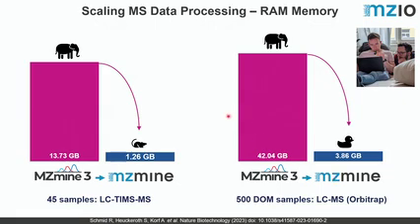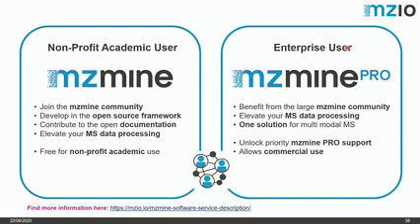And also, some people have struggled in the past with the RAM consumption of mzmine. So, for example, that you were not able to process large data sets, and you can see Robin and me here trying to put a lot of effort into optimizing everything. So we basically did a lot of progress there. So with the recent 4.8 version, I think we made a huge leap forward in that regard as well. And basically you can just sign up if you're an academic, and use the software for free.